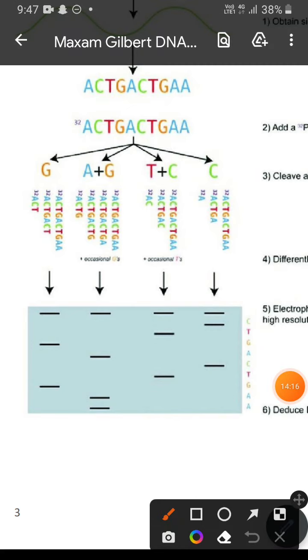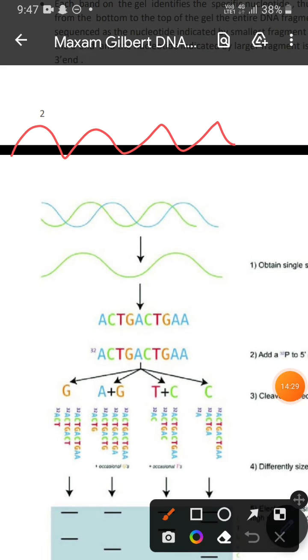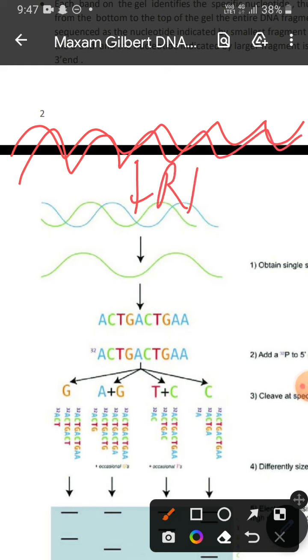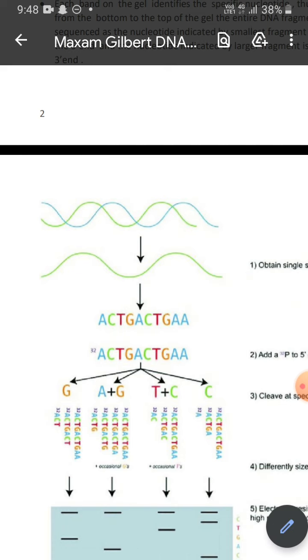Now I think your question will be, how can you determine, Shagnik, the 5' end adenine, right? That is the reason I have told you that if you have a very large DNA molecule, you will digest it with restriction endonuclease, where you have to use a mixture of 4 and 6 base pair restriction endonuclease cutters. So it will give us smaller fragments which are in overlaps.